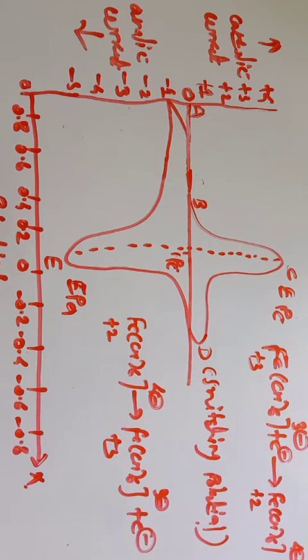Initially, we know that in cyclic voltammetry, three different types of electrodes are used. One is the working electrode, second is the reference, and third is the auxiliary electrode. The first point is that the working electrode, in this case, is a stationary platinum electrode, and the reference electrode is the saturated calomel electrode, in the cyclic voltammetric study of this potassium ferrocyanide couple.